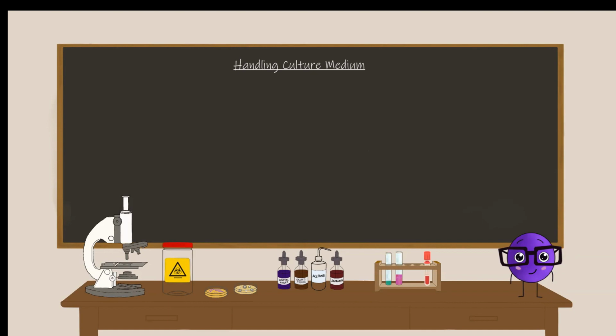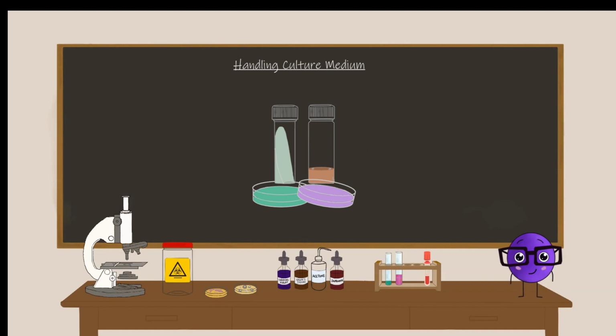Culture medium. We use culture media for the cultivation, isolation, and identification of microorganisms. This facilitates diagnosis and various other applications like pharmaceutical testing. Microbes like us have diverse preferences. To encourage the growth of specific types, we have different culture media options.